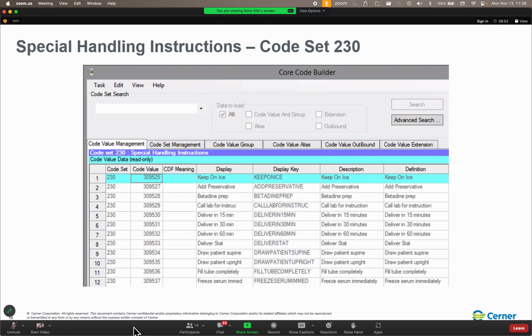In here, we've got three options. Define collection classes, associate benches and instruments to collection classes, and define collection requirements. Now, folks, we will get into why I do not recommend defining collection classes here in Bedrock. Let's just say that there are a lot of parameters that you still have to enter in the old school tool. Now, associating benches and instruments to collection classes, that actually is a good thing because then that defaults in the collection class when you're building out your collection requirements. But for right now, for this activity, we're going to select Define Collection Requirements and click Begin.